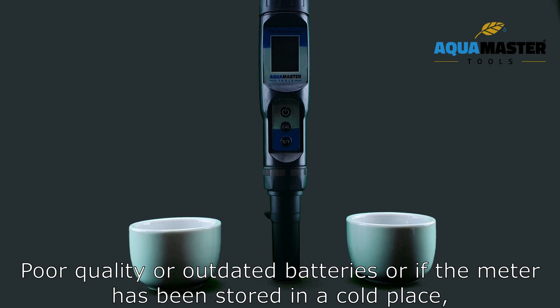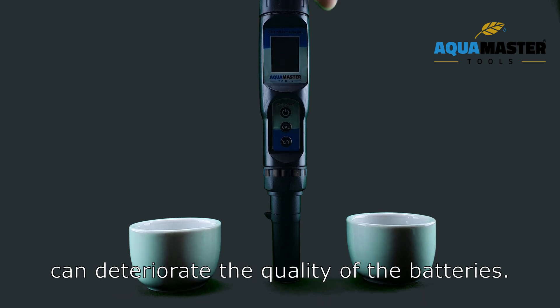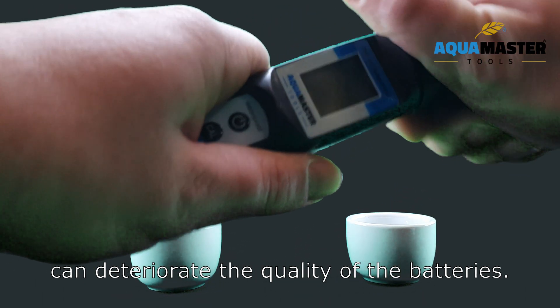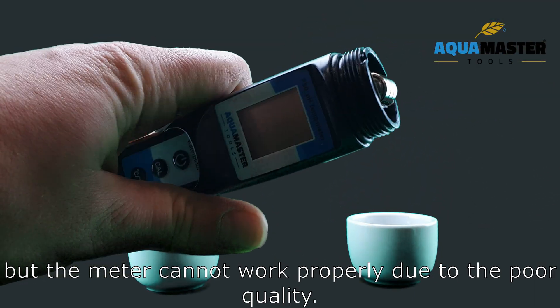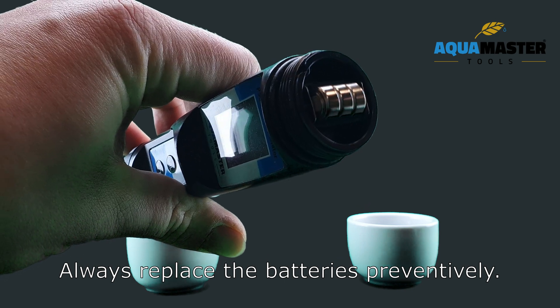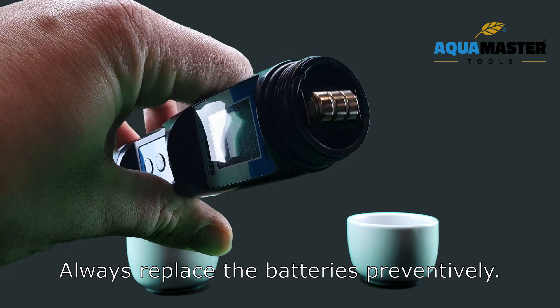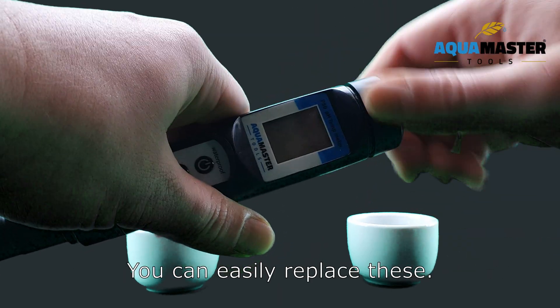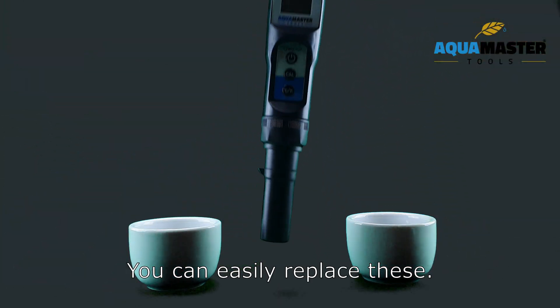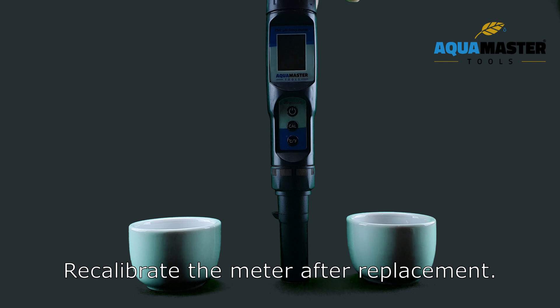Poor quality or outdated batteries, or if the meter has been stored in a cold place, can deteriorate the quality of the batteries. The battery indicator can show that they are full, but the meter cannot work properly due to the poor quality. Always replace the batteries preventively. The meter contains three 1.5V button cell batteries, which you can easily replace. Recalibrate the meter after replacement.